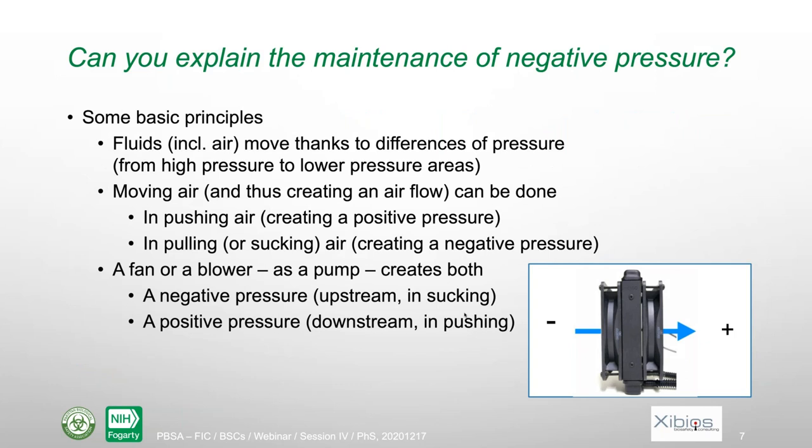The next question is, can you explain the maintenance of negative pressure? And it's true that in my presentation, I always speak about negative pressure and kind of assume that it's obvious for everybody, but it's probably not. So actually, there are some principles with respect to airflows and even water flows. Fluids like water, air, and so on move thanks to a difference of pressure. And they move from a high pressure area to a lower pressure area. That's true in nature also. Winds, for instance, are created this way.